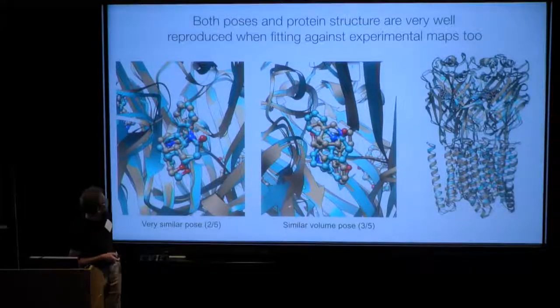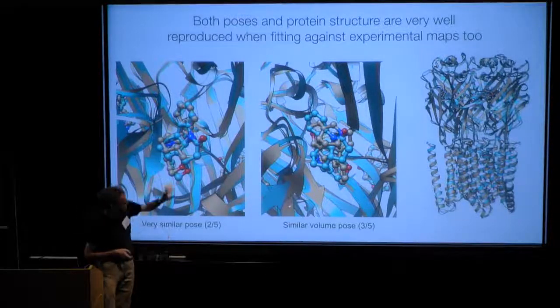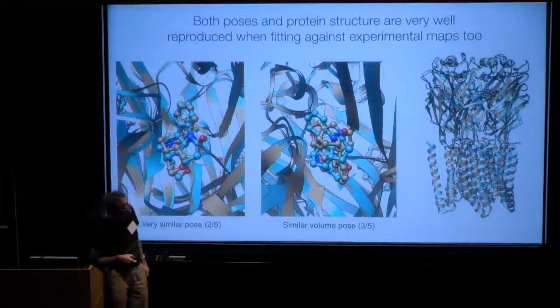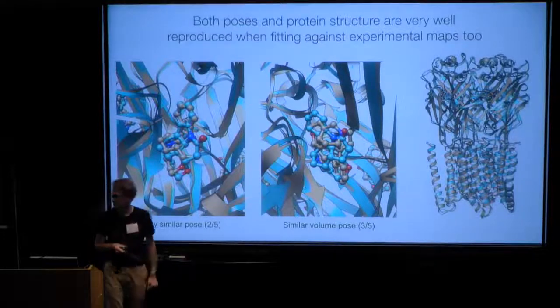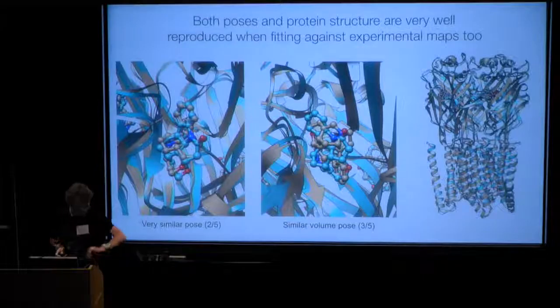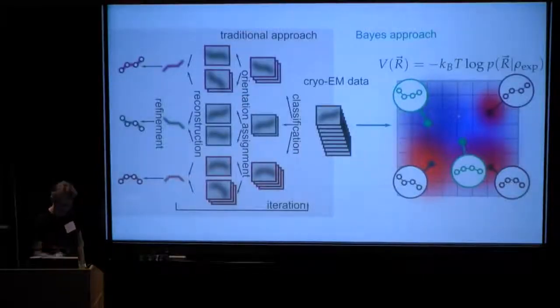But even here, the point is you get beautiful overlaps of the ligand placement. And even though we probably push too hard in this case, the protein is pretty darn good. There are not any obvious distortions or anything in the protein. And again, this typically takes between 30 to 60 minutes or so. It's completely automated, hands-off. And I think I'm pretty much out of time there, but I will sum up this in 2 pages.